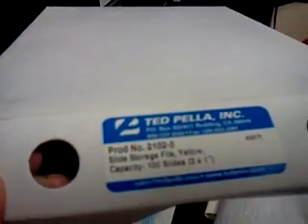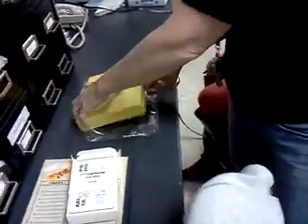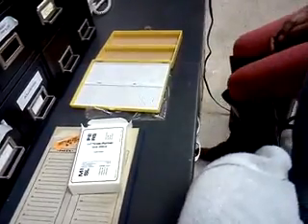These are called Ted Pella's? Or is it order from Ted Pella Company? I think I did order them from there. Okay. Now, what's neat about these are slide holder boxes. And these go... He has a few of those. These go in the freezer.